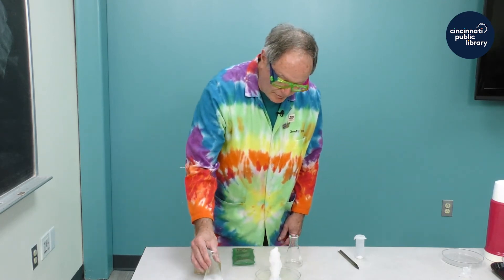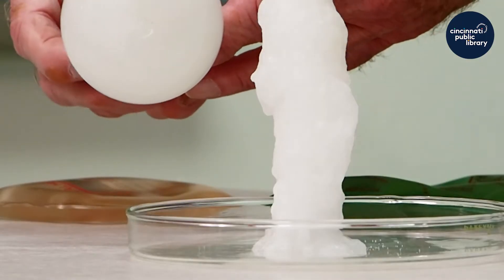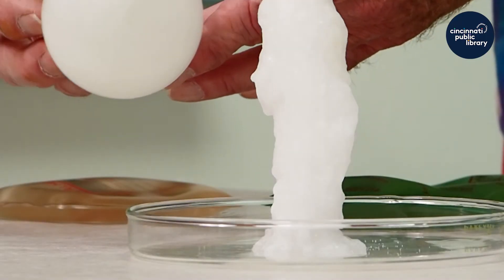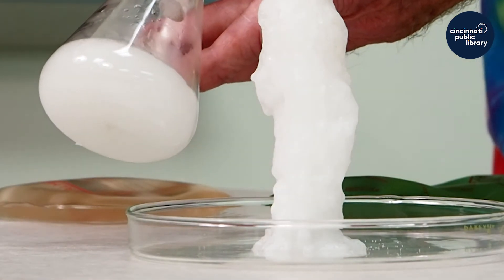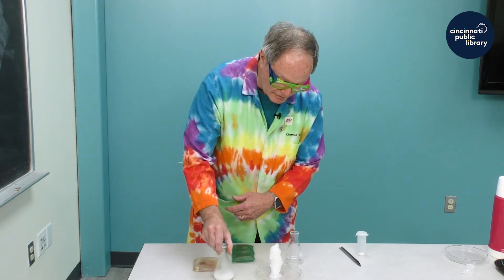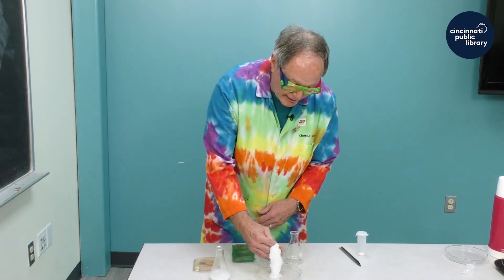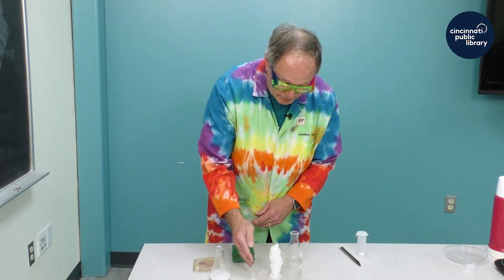I was going to pour a second solution, but as you can see, something stirred it and it crystallized in the flask itself. So I was not able to actually pour the solution. If I bring my hand next to this, it actually appears to be warm.